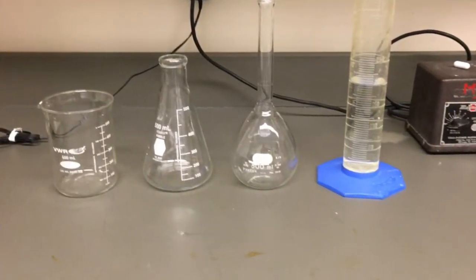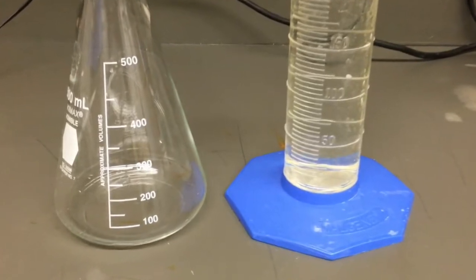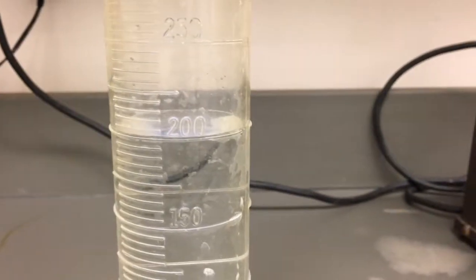When preparing general growth media, utilize an Erlenmeyer flask as it is easily autoclavable and has a narrow opening reducing the chances of spilling which might occur with a wide-mouth beaker.